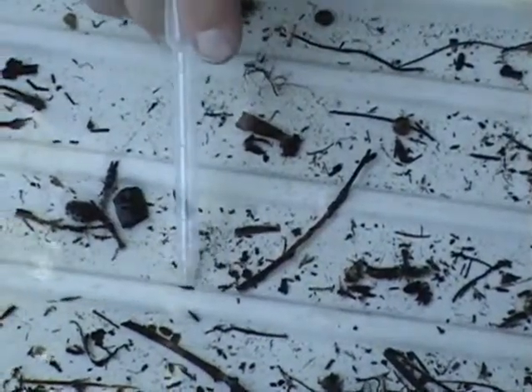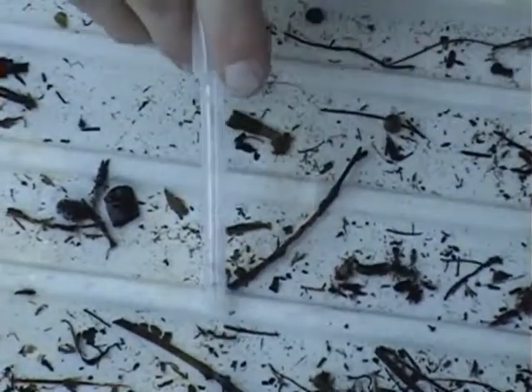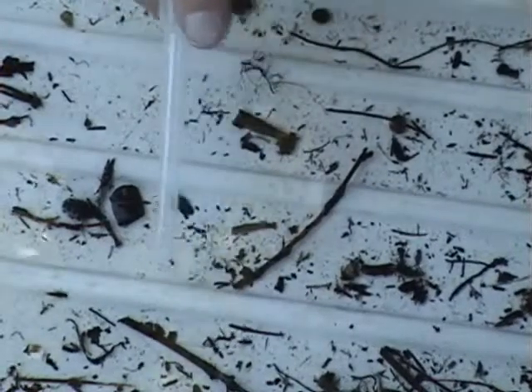Mayflies, on the other hand, will have three cerci. Generally speaking, these are mayflies here. Generally also, the mayflies will become darker with maturity, but that's a generalization.